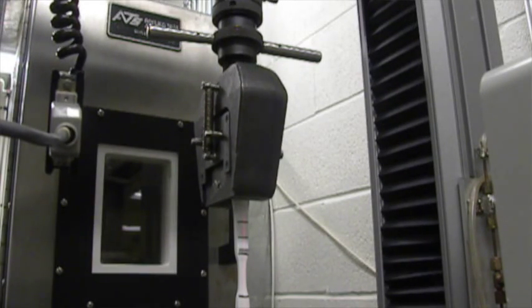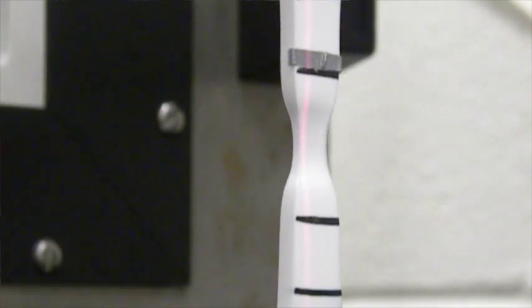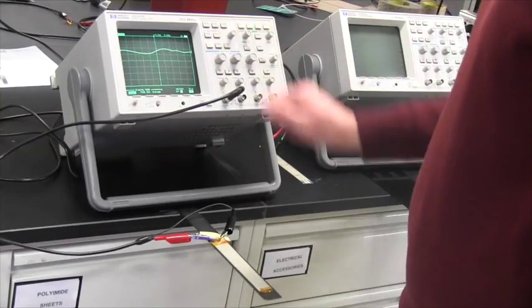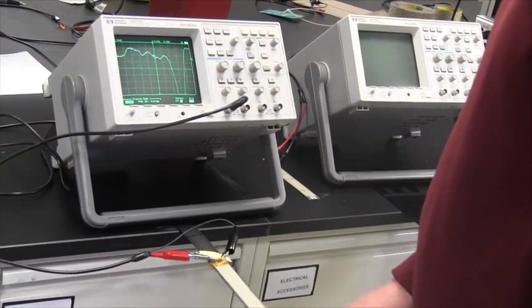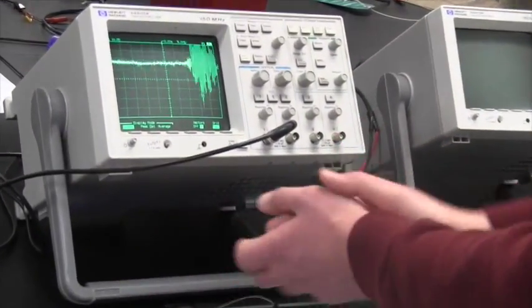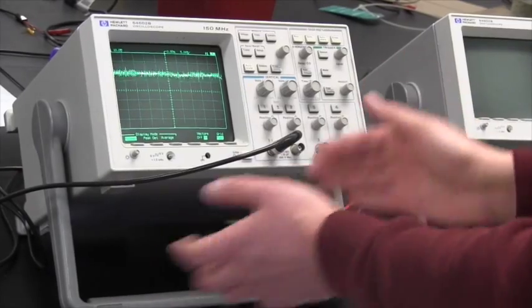Once these materials are processed in a form that we're interested in, ideally we need to understand the mechanics of it in many domains: electrical, mechanical, magnetic, and then coupled behavior. And so this is really of the field of mechanical engineering. We also have aspects of electrical engineering, aspects of chemical engineering and chemistry. So in general I view the projects and the character of EMCL as very multidisciplinary.